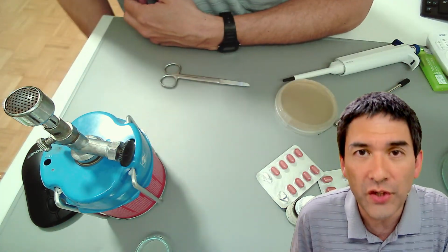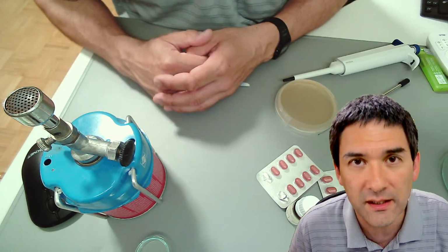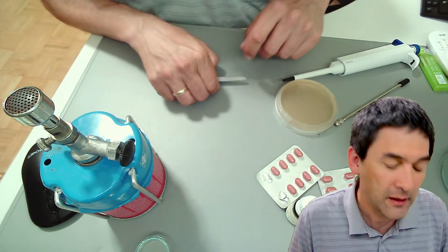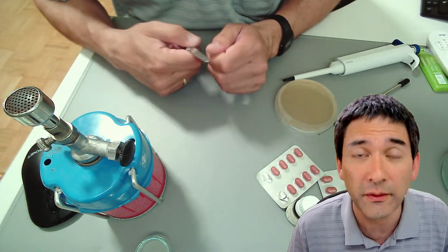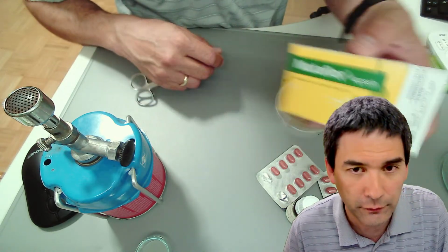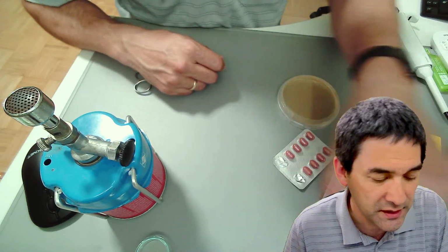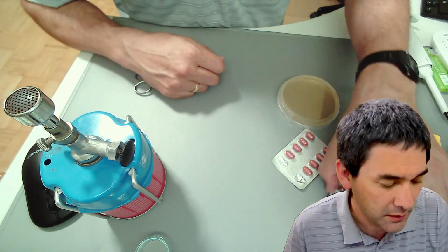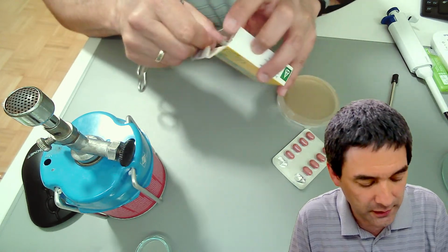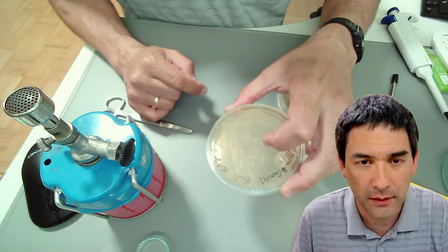Normally, if you are doing research, you write to an organization or company that sells cell cultures, and you can order almost whichever bacteria you want. Of course, they're expensive, and they might not send it to private people, and therefore we got those from the drugstore. That's a little bit of background info: I'm a teacher and we're doing some science experiments in schools. So this is kind of the idea, and I'm going to now show you a method of actually plating them.